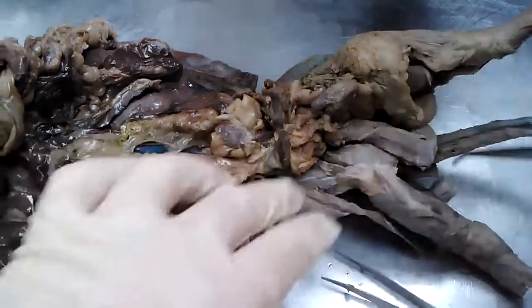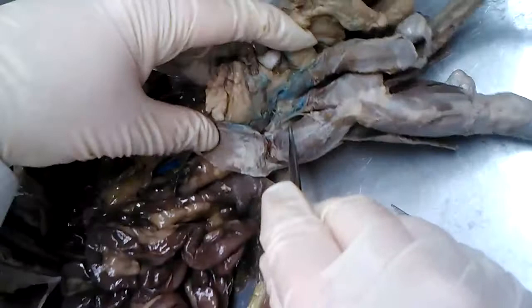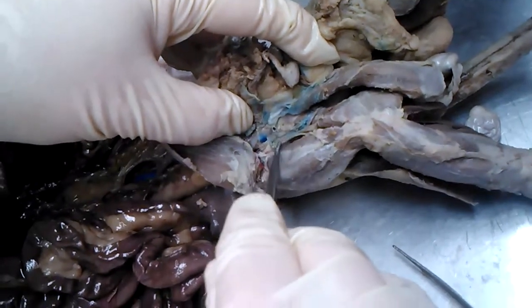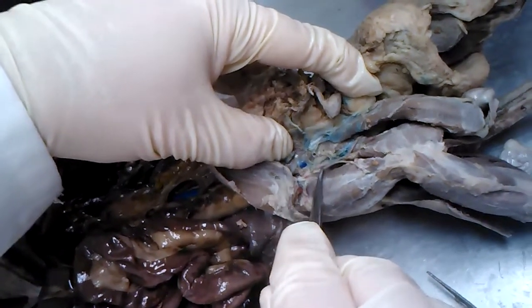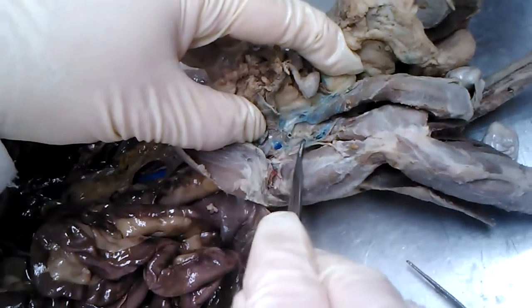Okay. Finally, the mink's thigh here, let's see if we can find, here we go. Little nerve here, the nerve you see here, the little white string, that's the femoral nerve. Right beside it, there'll be a femoral artery, the little red thing here. And the blue thing is femoral vein. So nerve, artery, and vein, in that color, in that order in minks and in humans. Femoral nerve, femoral artery, femoral vein.